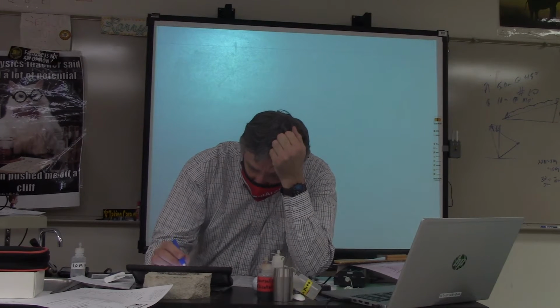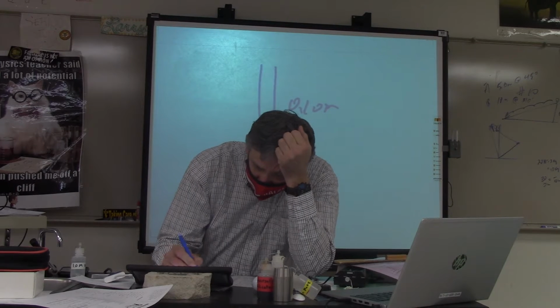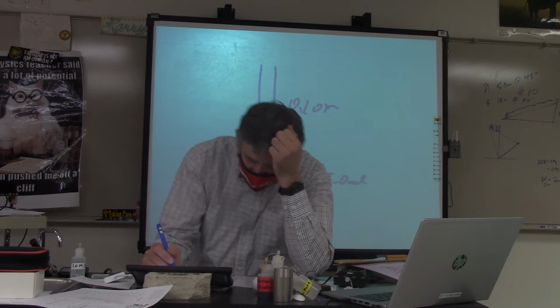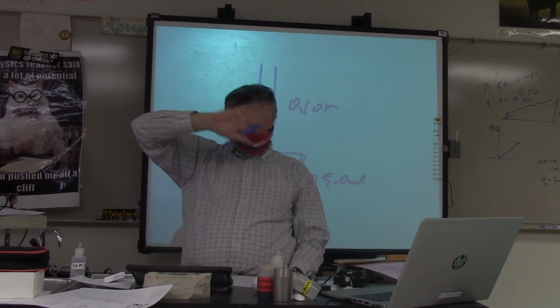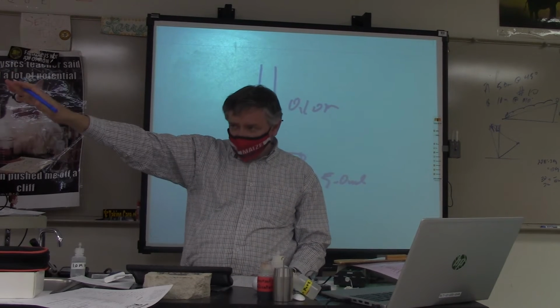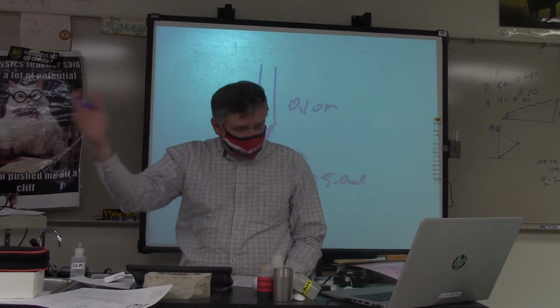You had the burette and you had 0.1 molar solution in there, so you knew the molarity of the sodium hydroxide. And the first thing that you had in there was that 25 milliliters of acetic acid, and that was just straight acetic acid, okay? There was nothing else with it, it was just straight acetic acid. So they measured it, they did the titrations, all this good stuff.